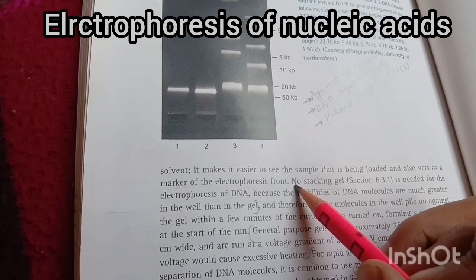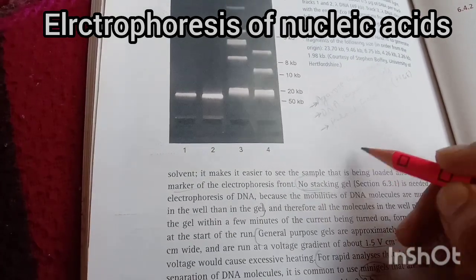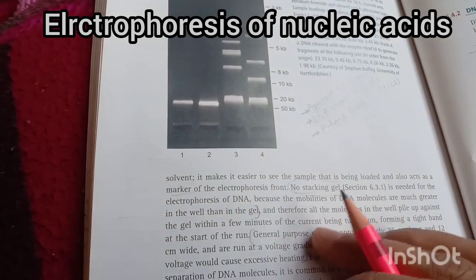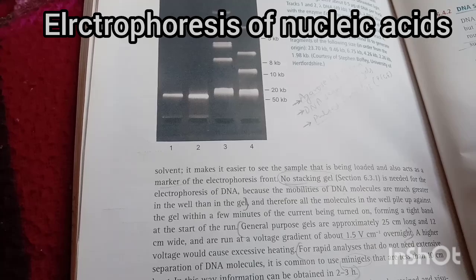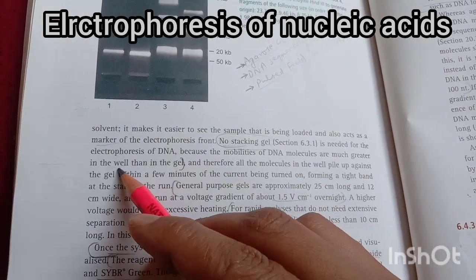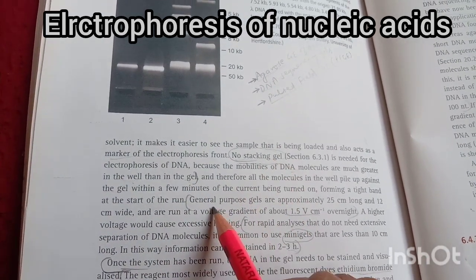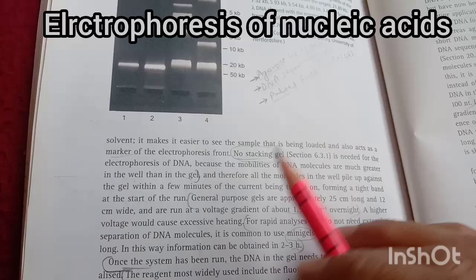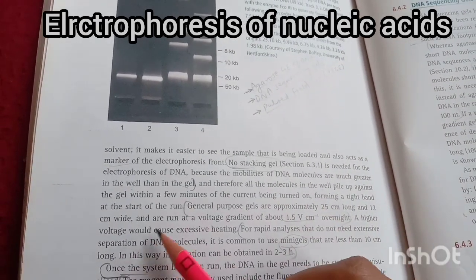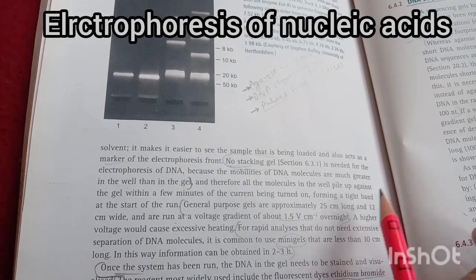So we don't use a stacking gel here. Now what is a stacking gel? It increases the mobility, okay? No stacking gel is needed because the mobility of DNA is already greater in the well than in the gel. In the well, the mobility of DNA is greater compared to the gel, okay? So if we talk about general purpose, it should be 25 centimeters long and 12 centimeters wide, and run with a voltage gradient of 1.5 volts per centimeter overnight.